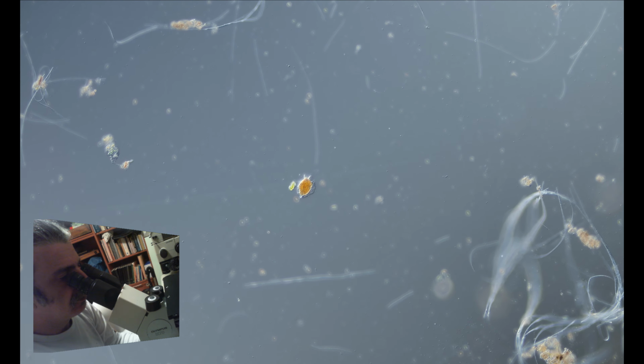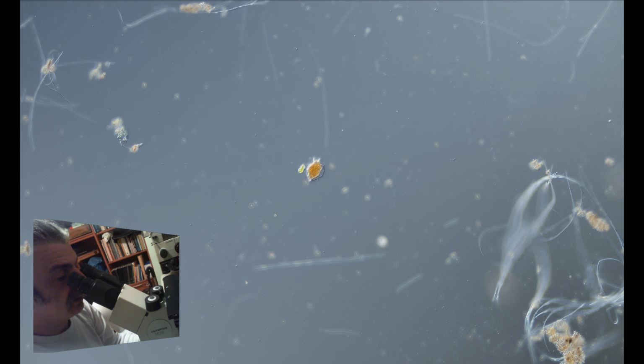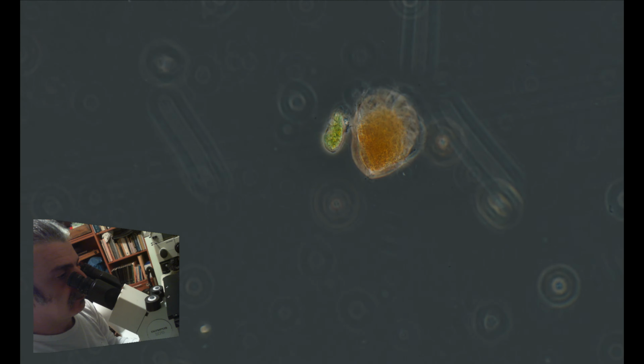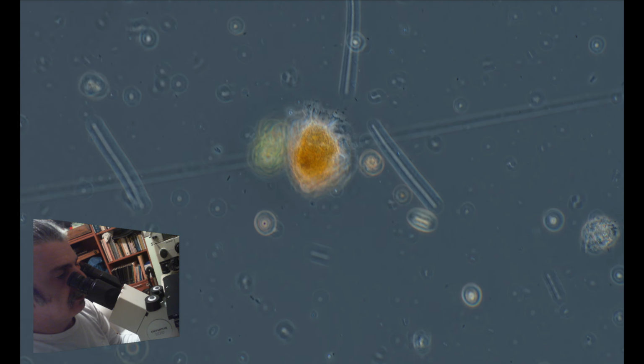Here is another one of those amoebas that we've seen earlier. I want to look at it with phase contrast. I think it got a prey next to it. So let's explore it with the 40x. Okay, nice.